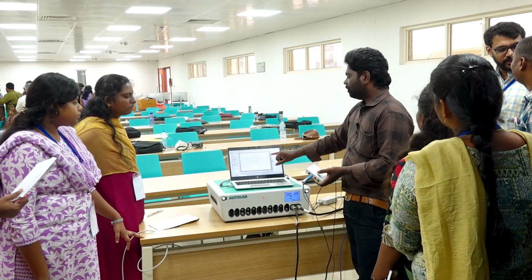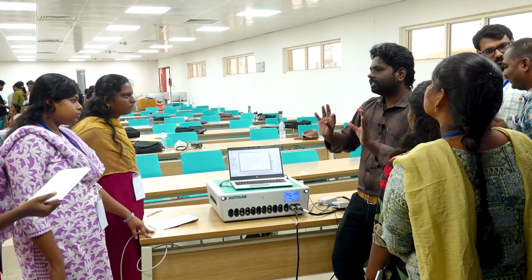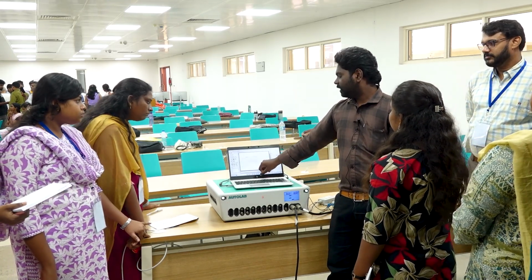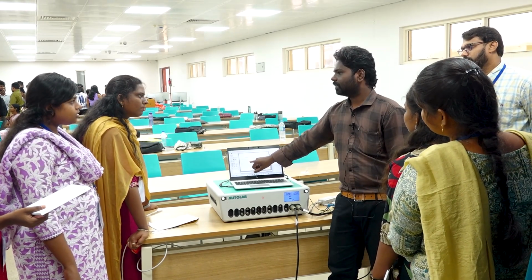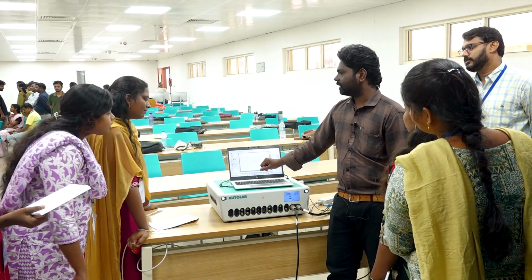So now I just copied the values and pasted here, and it automatically draws a circuit. Do you know why the first one is the internal resistance?